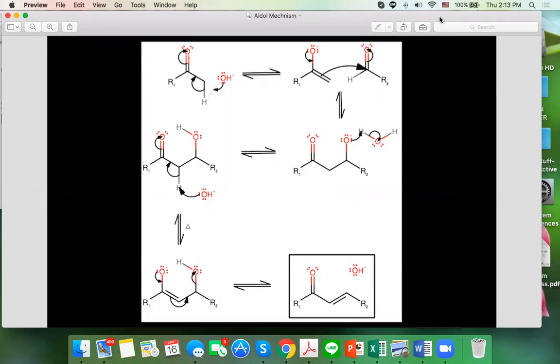Now this is the molecule that has alpha hydrogen. It forms water. I'm adding a base. Now tell me, everybody, do you have the lab manual with you? Tell me what kind of base you're adding. NaOH. Thank you, Cindy, you're so quick. Sodium hydroxide, wonderful. Tell me, are we adding this sodium hydroxide in solution form or in pellet form, according to the lab manual?